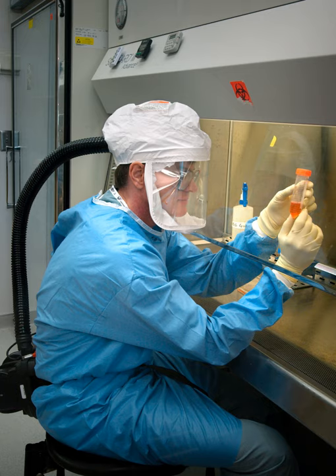The Type C1 BSC was born out of necessity to control infectious material and chemical hazards, reduce operating costs, and add flexibility in modern laboratories. The Type C1 moves air by mixing inflow air with the air in the columns of downflow air marked for recirculation. Air above a clearly delineated section of the work surface is drawn by a second internal fan where it is exhausted through a HEPA filter.